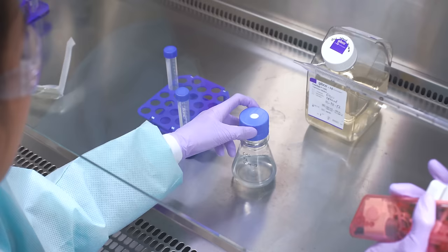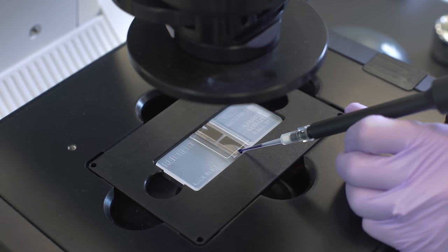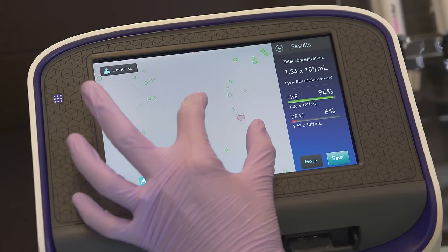When passaging suspension cells, you'll begin by removing a small sample from the cell culture flask for counting. You'll follow the same counting procedure for adherent cells using Trypan blue and either a hemocytometer or the Countess automated cell counter.